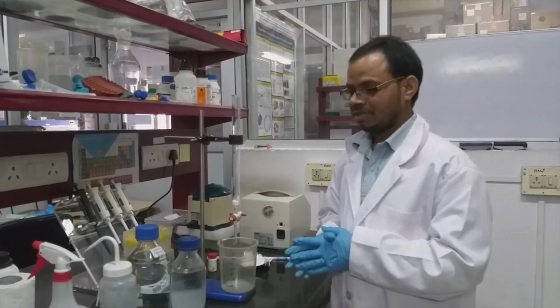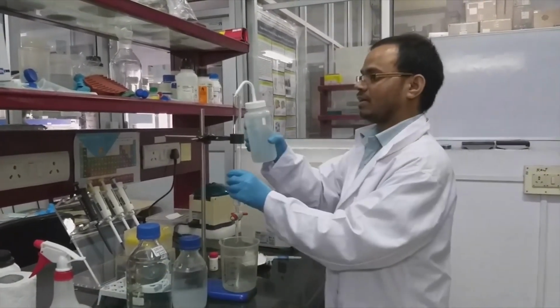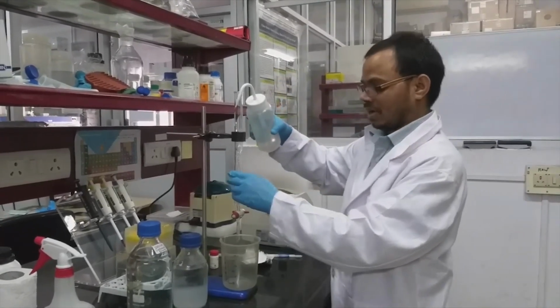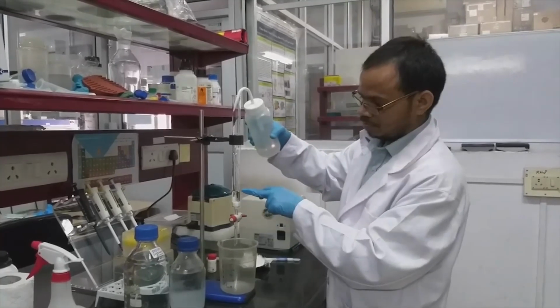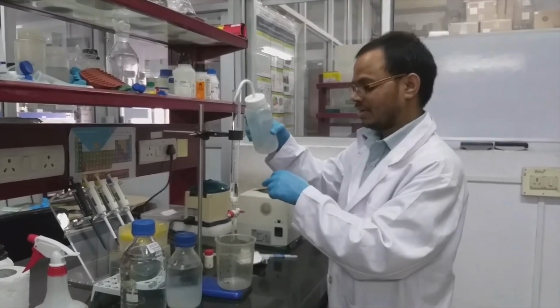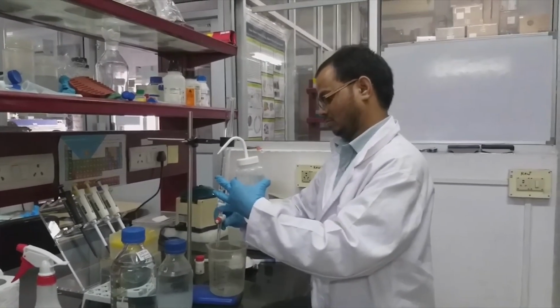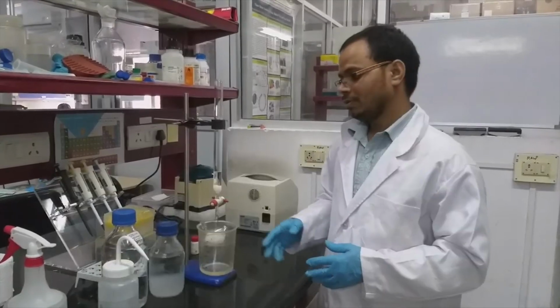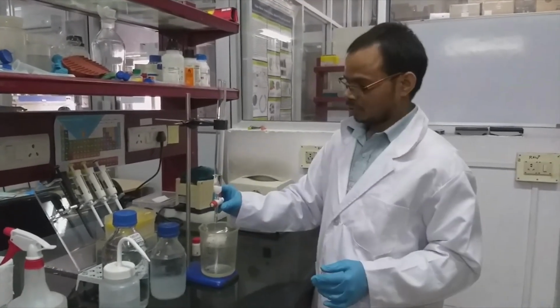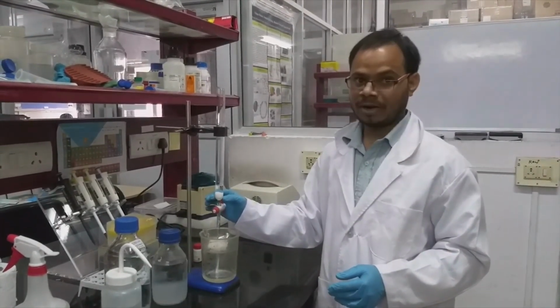Before loading the beads, I am going to wash the column properly so that there are no other particles present inside the column, and also to soak the cotton which we inserted in this. Now we wash the column properly. So the cotton, the bottom cotton also, is soaked properly.